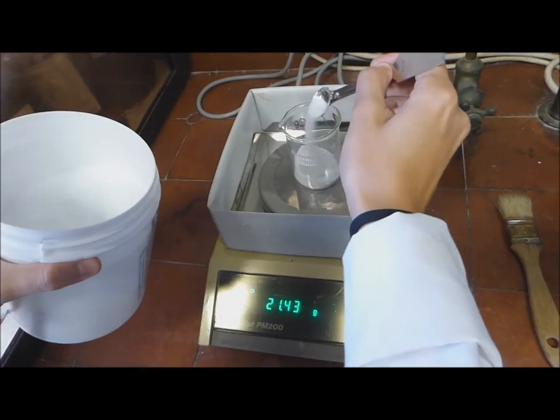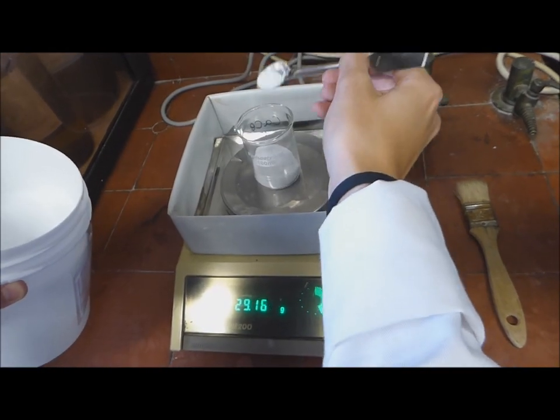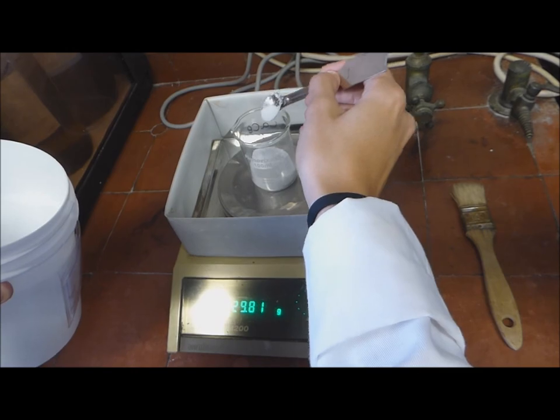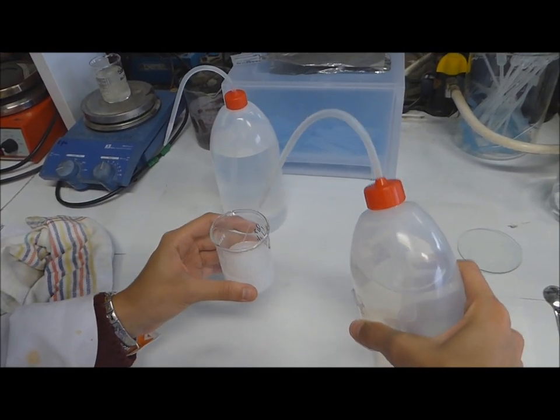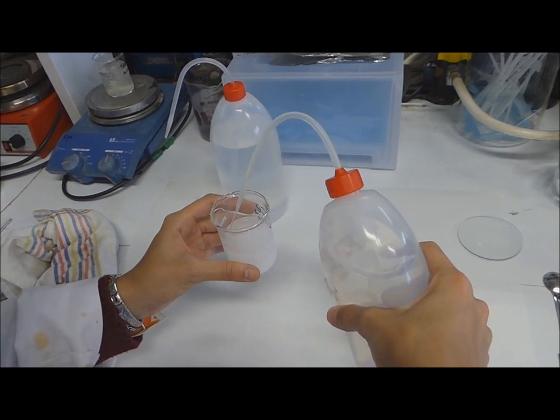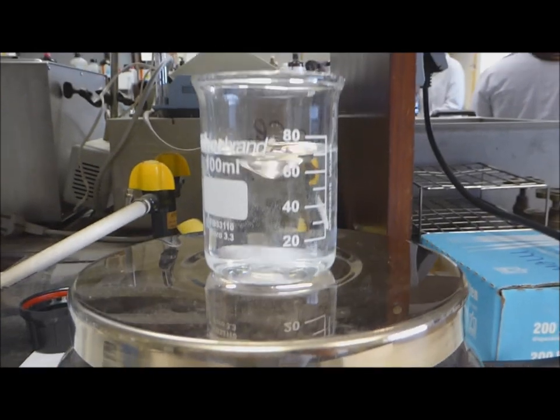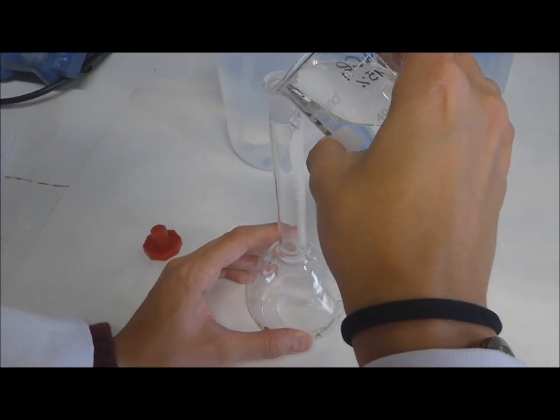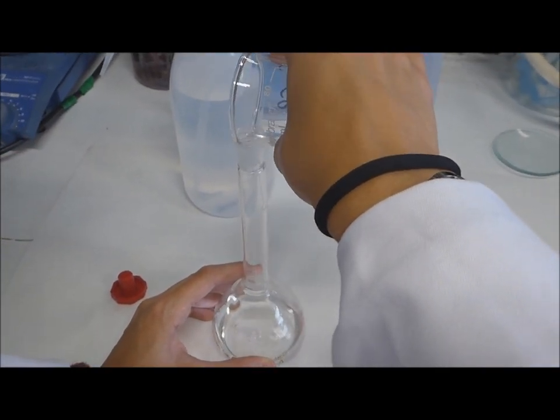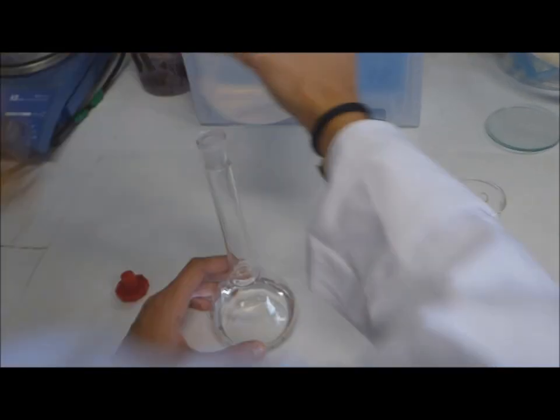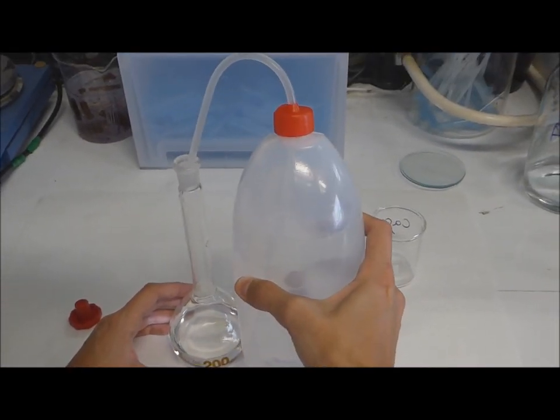We weigh 30 grams of calcium chloride and we add it into a tumbler of 100 milliliters. Then we add 100 milliliters of distilled water. It is an exothermic process so it's important to let it cool. After that we transfer it into a volumetric flask and we complete the volume until 200 milliliters.